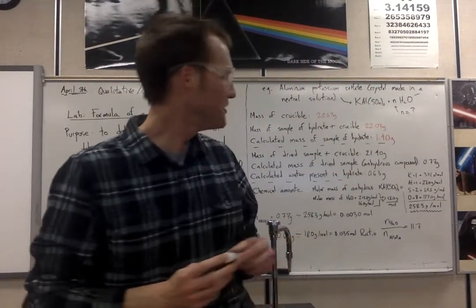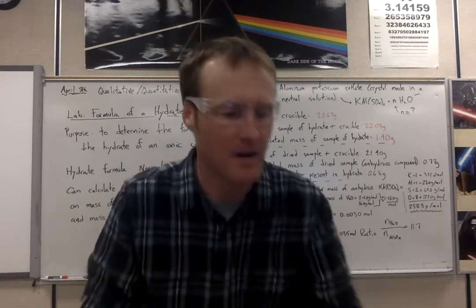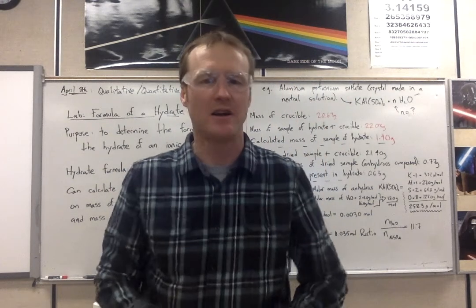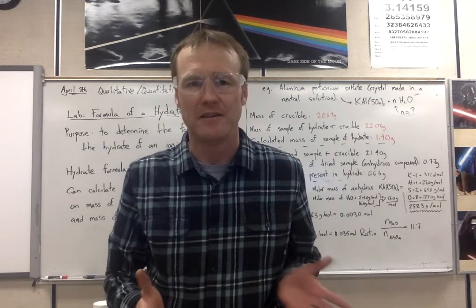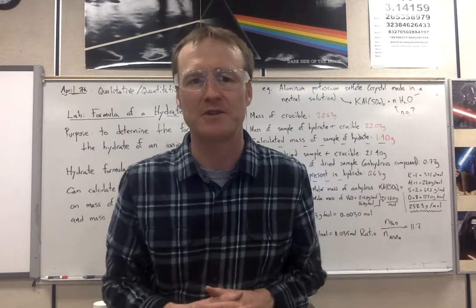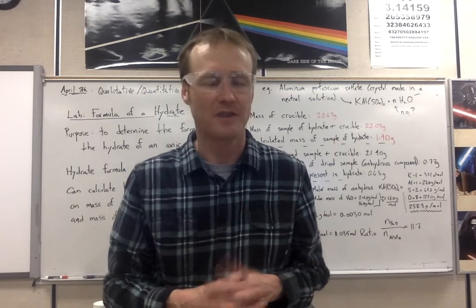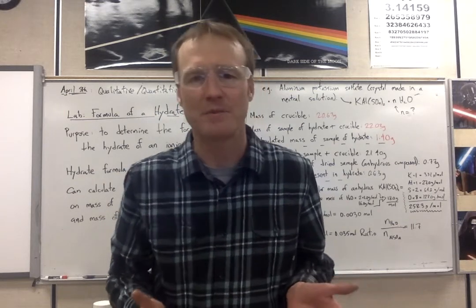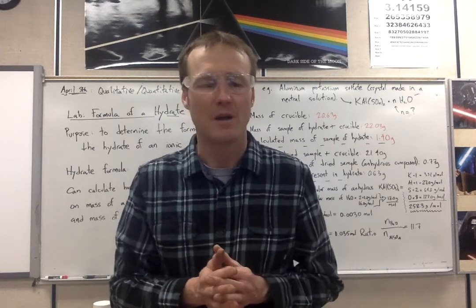That's an interesting result. Not really what I expected, I'll be honest with you. I expected that there was going to be a lower value of 8. But again, you never know in chemistry. There's always a possibility of being surprised. Maybe there was some contamination there. I don't really know, but that's totally fine.